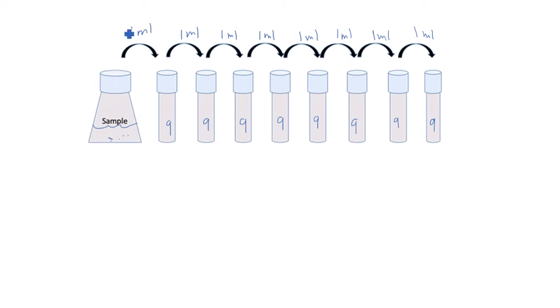So we are taking 1 ml from the original sample and adding it into a tube where you already have 9 ml of diluent present. So you're adding 1 ml into a total of 10 ml. That is why it's called tenfold dilution, because every single tube that you dilute into is going to be either 10 ml total or a multiple of 10. So it can be 10, 100, 1000, something like that, but it's going to be a multiple of 10.